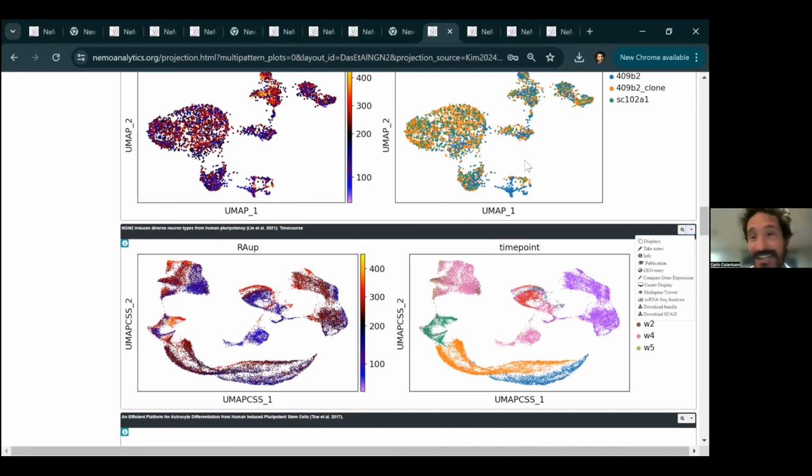I'm really hoping that a lot of people start to use it because we have a gap between the paper where all the details are, but of course you can't interact with it, and the repository where the data is, but you have to go download it. You have to make sure the metadata are there. You have to curate the metadata, ask the authors, oh, you forgot to put the time or the samples in there. Okay, thanks. Now I download them. Oh, it's in a different format from my other one. So looking at them all, you can do right in NeMO, and anything you see in NeMO, you can just click and get.